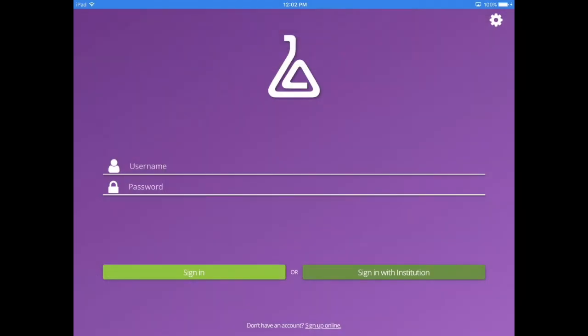The LabArchives app for Android and iOS devices allows you to view and edit entries in your lab notebook. In addition, the mobile app leverages the convenience of your mobile device to add photos, videos, and audio files to your lab notebook.